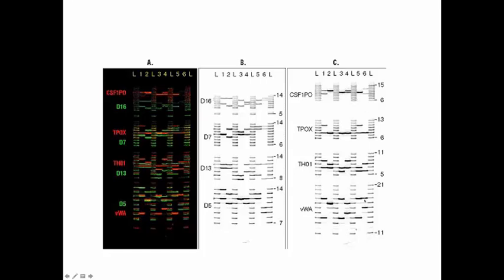And it's also important to realize on this gel, they're loading these size range markers. So for VWA, for person number 6, for example, you have one band right here and one band right here. We're not looking at that and that. That's from person number 5. This is person number 6 right here. So for person number 6, we go down to the VWA site, and they have a band right here and right here. So here we have 11 repeats, 12, 13, 14, 15, 16, 17, 18. So we would put somebody into kind of like an Excel spreadsheet. We'd say, okay, at VWA, person number 6 is 16, 18.